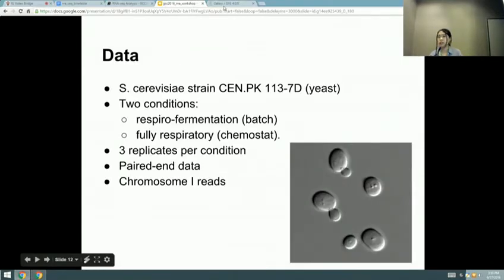Yeah, 12 FASTQ files and one GTF file. There's two files per sample. So that means there are two conditions, and they each have triplicates. Condition A versus condition B, we get 3 on this side and 3 on that side.